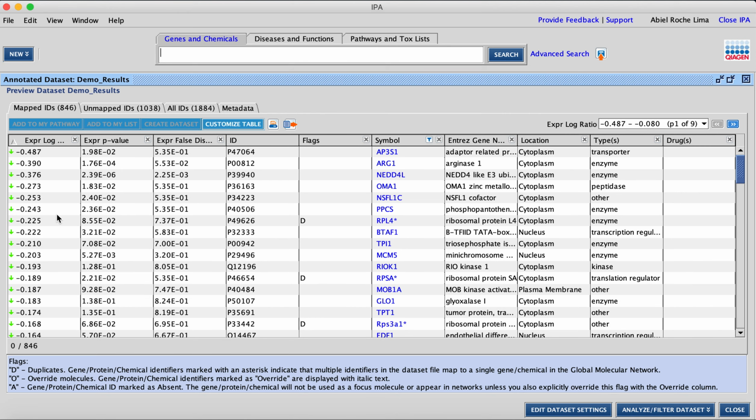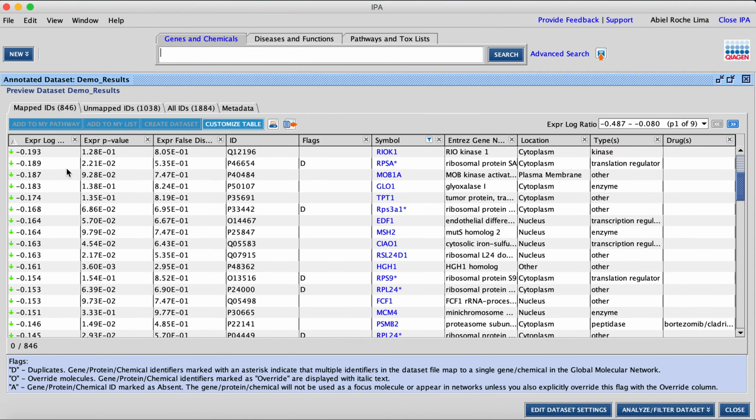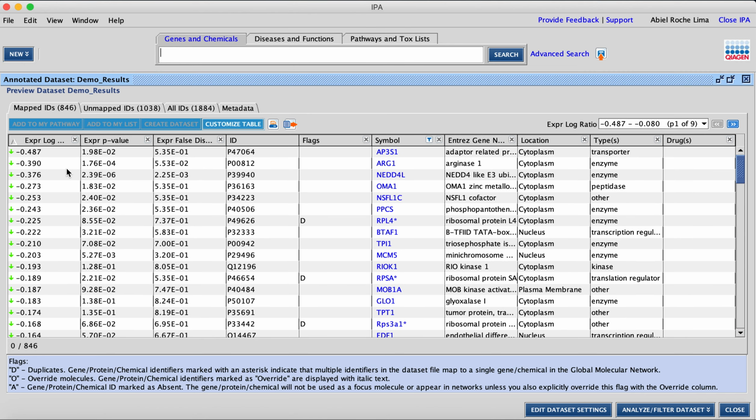We notice that the parameters of fold changes need to be recalibrated, but that's something we can modify, because in this case, we are satisfied with everything we are seeing. So these values are modified. We need to rescale them. A way to do that, we are going to do later on.